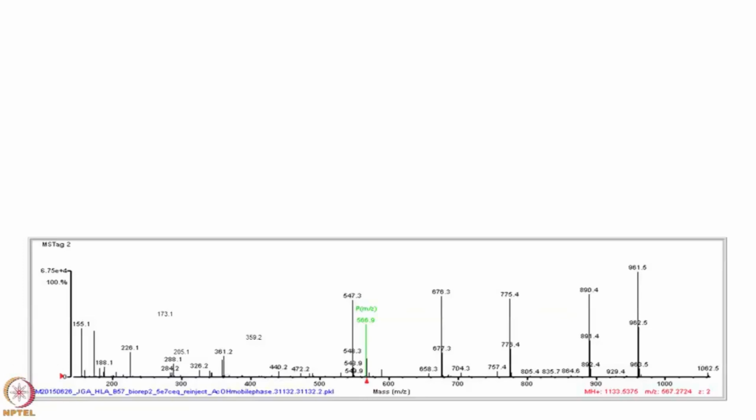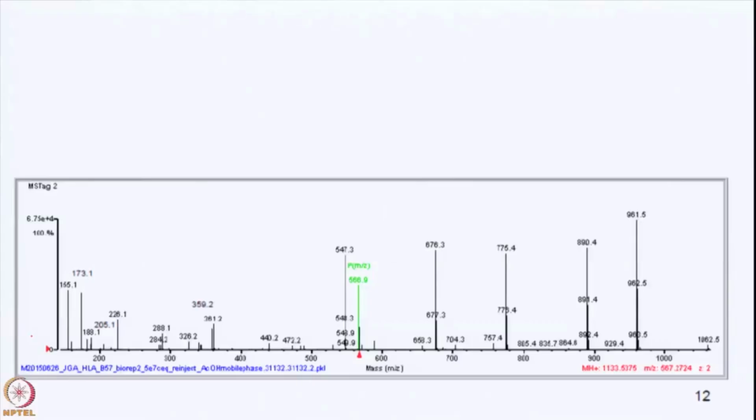All right, so this one is a good example of why I like to start at high mass. This one is also not a tryptic peptide. I can tell by the file name where it says HLA in it. So this is again immuno, and the allele is B57. So it's again something that should end in tryptophan or phenylalanine.